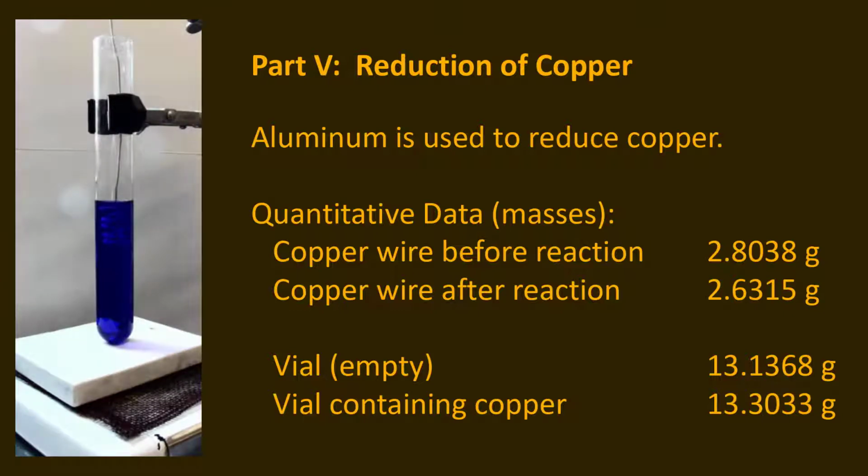So one of the only ways to get these reactions to work is actually to use hydrochloric acid. In this case, the generation of the hydrogen from the hydrochloric acid is not productive. You're consuming aluminum, and the aluminum is going to be reducing hydrogen, not the copper that we're interested in.